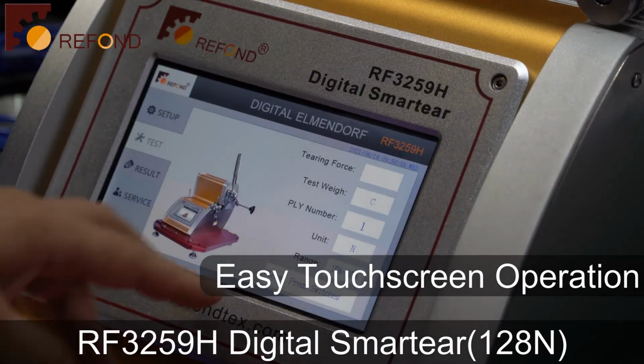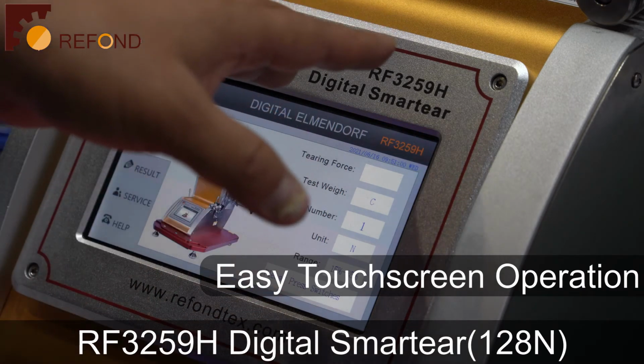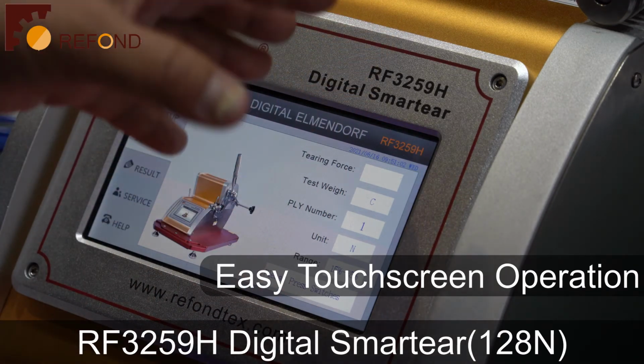So in the testing page, if the weight is not suitable for this test, you can choose to use the lightweight or to use the heavy weight.